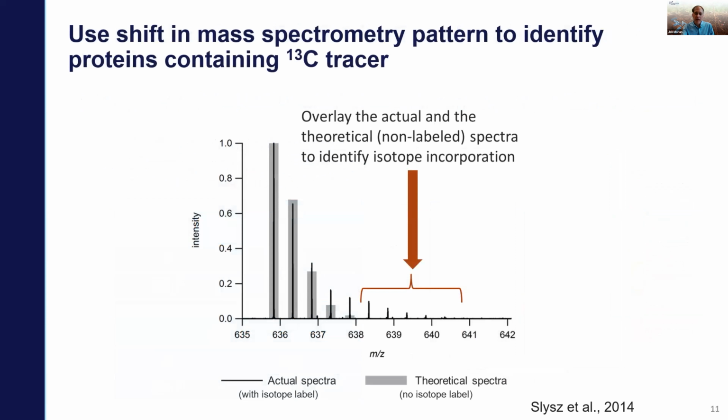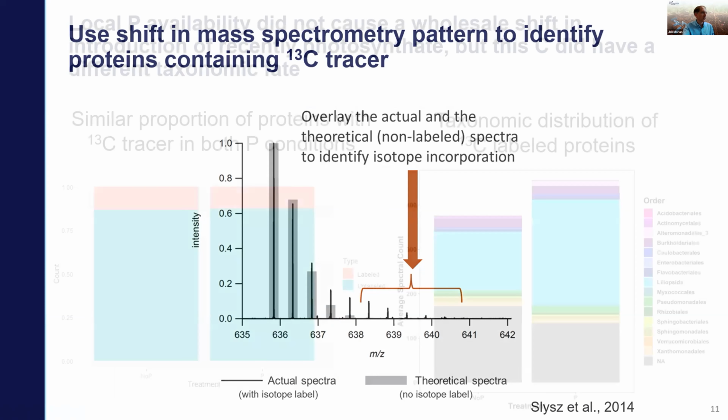We wanted to go beyond just that. You will recall that I mentioned we used a 13C tracer. EMSL has really been spearheading this effort to automate pulling out proteins that contain a 13C label. And this is in general how it works. When you incorporate enough 13C tracer into a protein, or into a peptide in this case, you begin to see an enlargement of the mass spectra, sort of a blurring of it over into higher masses. So these mass ranges to the right would indicate that this peptide has potentially some extra 13C attributable to the tracer, and that would not naturally be there.